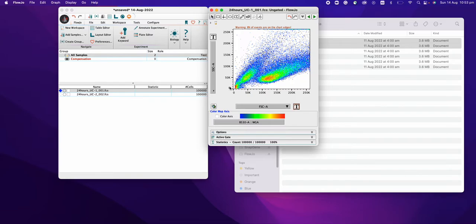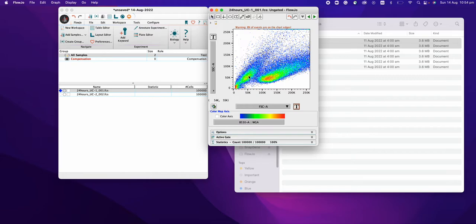So firstly, let's see this side scattering area versus the forward scattering area. You can see two populations are there, but you have to select one population. If you just try different cells together, then these kinds of images you'll get. For cleaning up, the first population is not the real cells — these are the digested ones — and these are the real cells from this experiment.